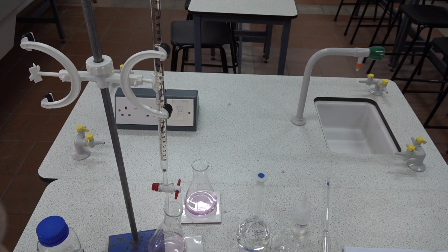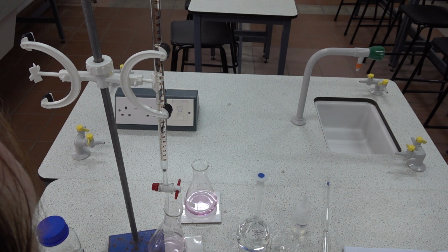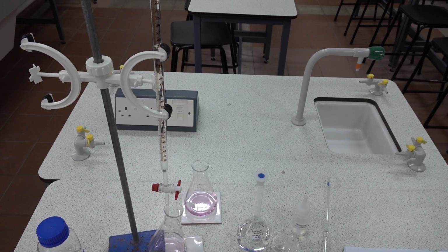Our reading on the burette is 29.2, it's just a little bit over. 29.2 is our final volume for the titration there, and we need to record that in our lab books.